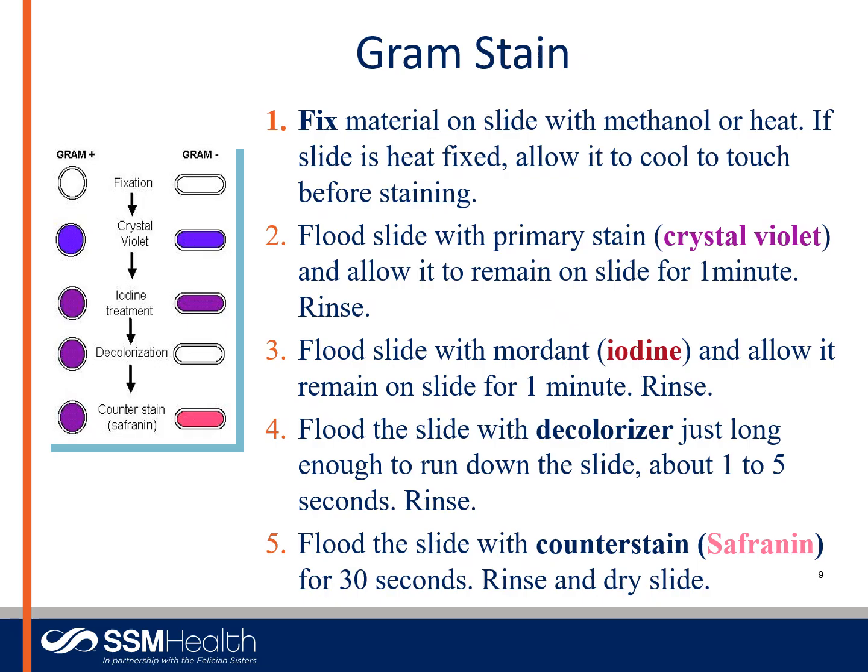Okay, I love a good graphic. I'm a visual person. I like to kind of follow along and see what I'm looking at. Okay, this is the really basic procedure for the gram stain. The procedure is on the right, and on the left is what it looks like at every step.